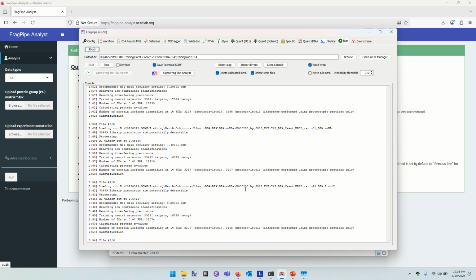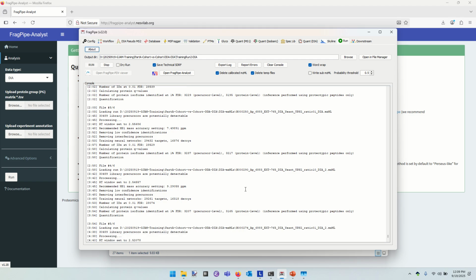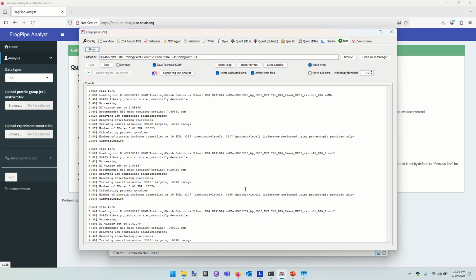Yes, it is. I'm typically running on a 12 core at home, and its ability to rocket up to a high clock rate is wonderful. Yeah. I don't think any of my computers is below 32 gigs of RAM at this point. I run the software often enough that I want to benefit from it. I think this one might actually be.